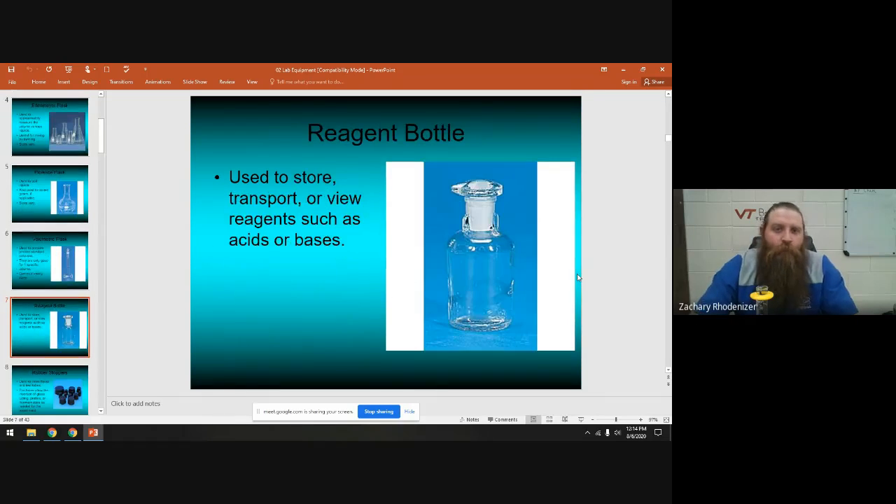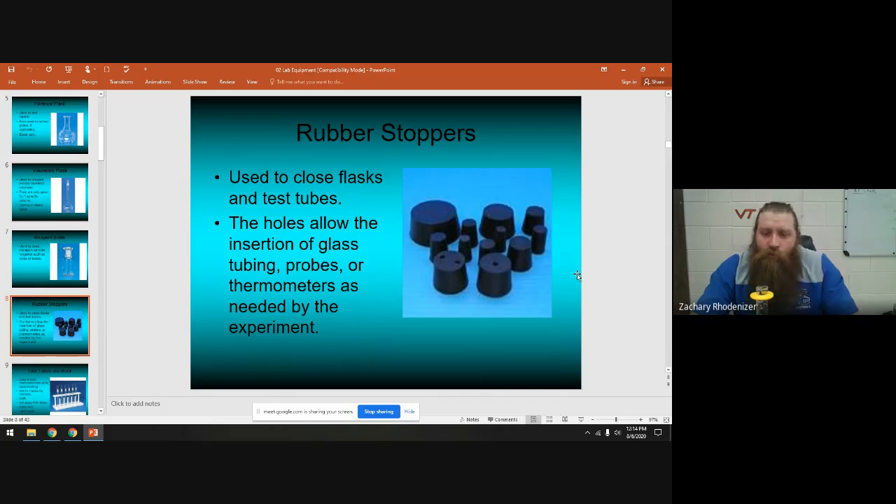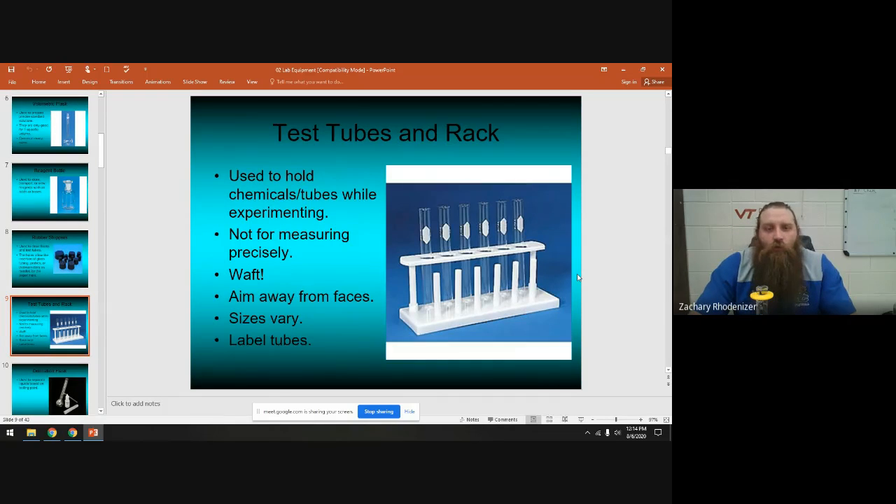A reagent bottle is just a bottle with a label indicating its contents — like hydrochloric acid — used to store chemicals. It usually has a sealable glass top. Rubber stoppers come in two types: ones with holes and ones without. If you want to seal something, pick one without a hole; if you're running a thermometer through it into a beaker, make sure it has a hole.